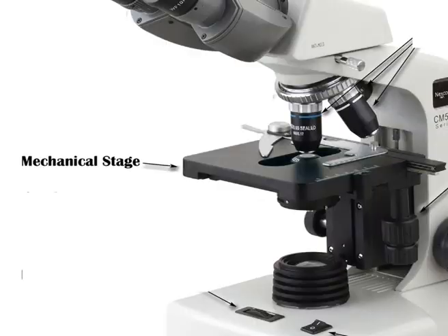Now, what is a stage? A podium which holds the specimen which is being viewed is known as the stage. It is present beneath the objective. A hole is present in the center of the stage to let the light pass for the illumination of the specimen. Arms are usually present to carry the slides.